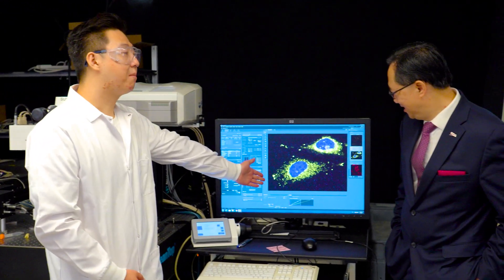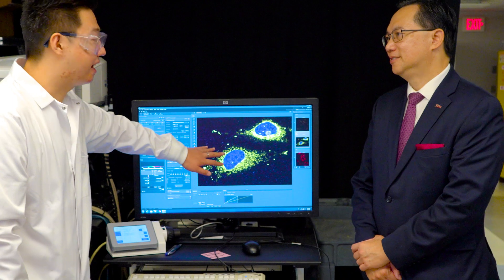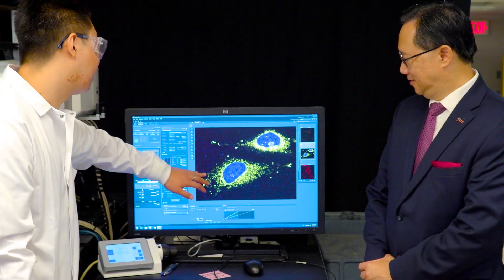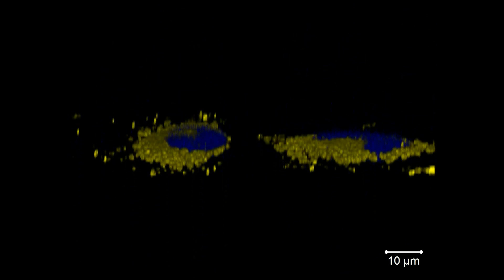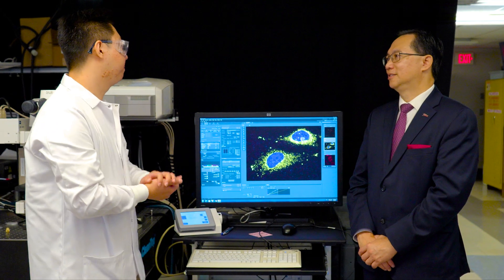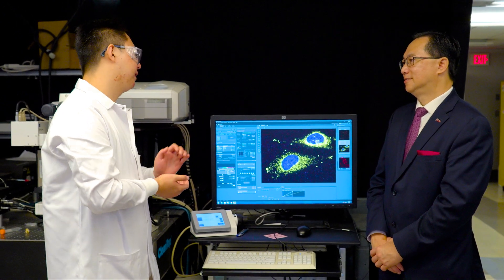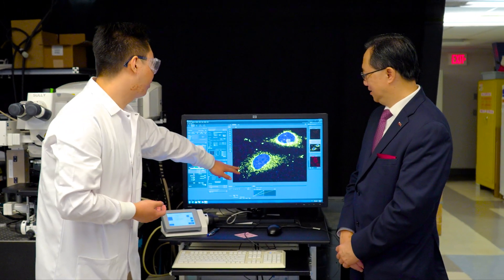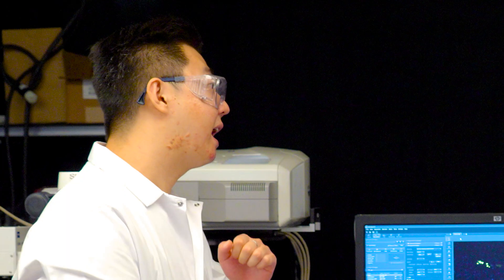Sure, no problem. This is a compound we worked on in this summer project. You can see that we use two different dyes on our cell. One is a commercial dye — we use it to mark the nucleus. The yellow part is our compound, and it marks the mitochondria. Because it can scan different layers, if we combine the layers, we get 3D structures. We use our products to target the mitochondria, and because the mitochondria is the powerhouse of the cell, there are so many diseases related to it — like cancer and Alzheimer's disease. If we use light to irradiate this compound, the anti-cancer drug can be released directly into the mitochondria, and it can kill the cancer cell.